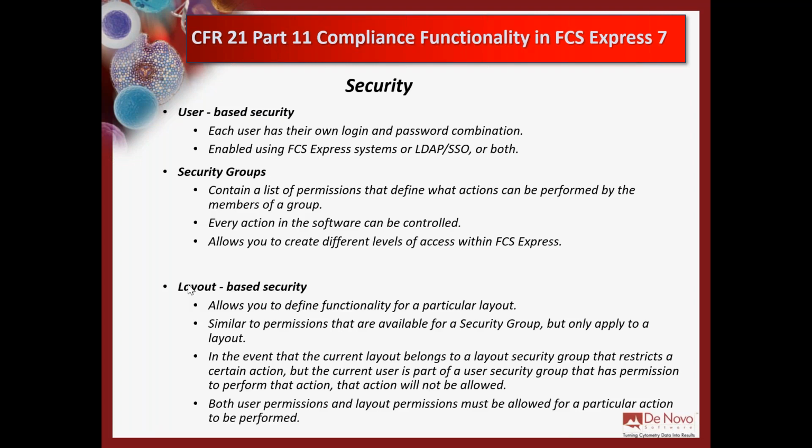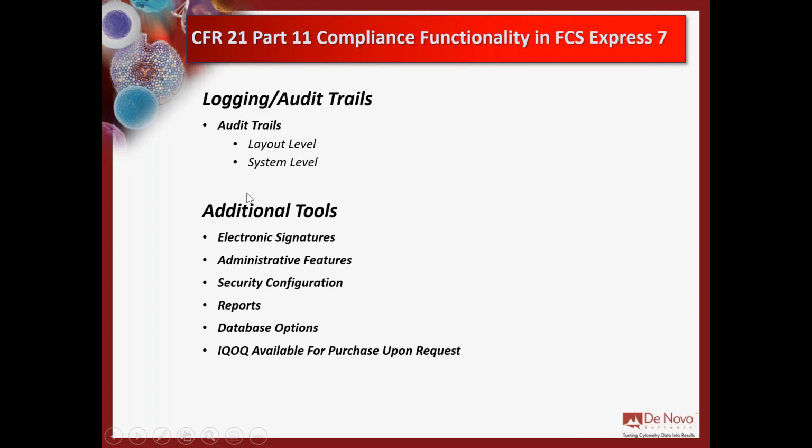So you can imagine, you have a layout, and in that layout, you're not allowed to, say, move a quadrant, but a particular user is allowed to move a quadrant. Well, if that user comes into the layout, it is secured so that nobody's allowed to do that sort of thing. And again, we're going to come back in and take a look at that in the software itself. Now, the other part of CFR 21 Part 11 compliance, another major functionality there, is audit trails, right?